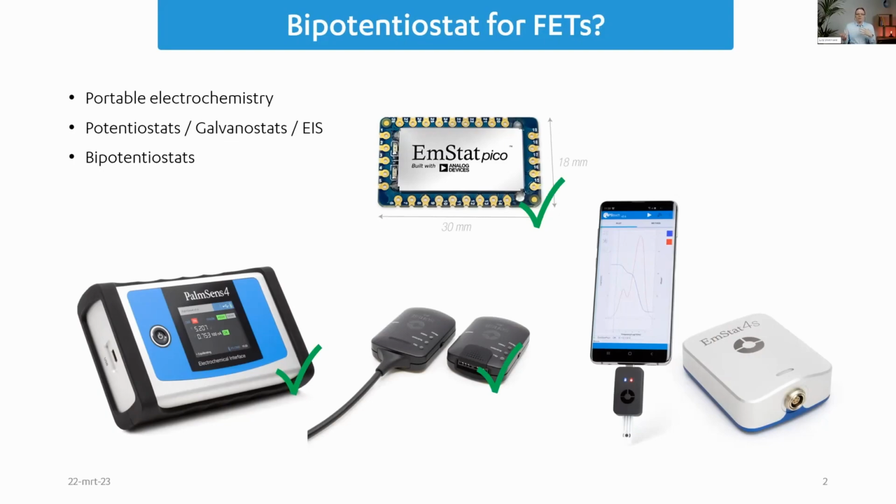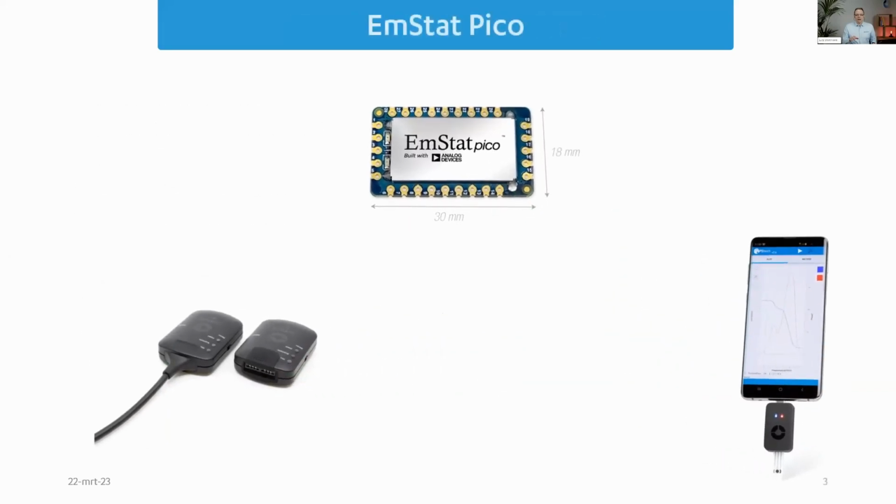And over the years, every now and then, we had the question, can you use these for field effect transistors? We thought, yes, it must be possible, right? But we've never tested it. So we looked into literature, and we were a bit surprised how little documentation there is out there on how to use your everyday potentiostat for field effect transistors, because they are a part of the electrochemistry community. Anyway, we thought we should really start a project to see how this is working.